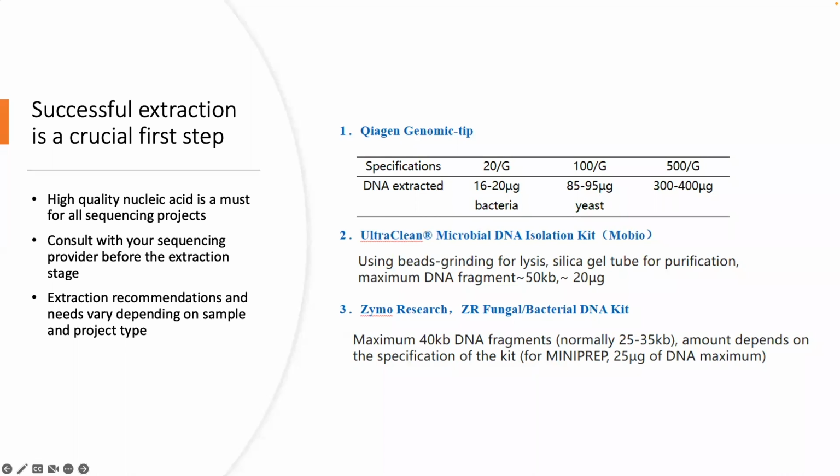Yeah. So as Kyle mentioned, one of the biggest issues is the extraction itself. And one thing we have to keep in mind is where the material is coming from. So if it is a pure sample, we're really just dealing with culture issues. Do I need to remove any sugars or any minerals that may end up in the DNA? Some common things for that would be dialysis kits, which allow for buffer exchange after extraction. But really, if we're dealing with environmental microbes, our biggest hurdle would be just the uncertainty in the environment. Thanks, Charles.